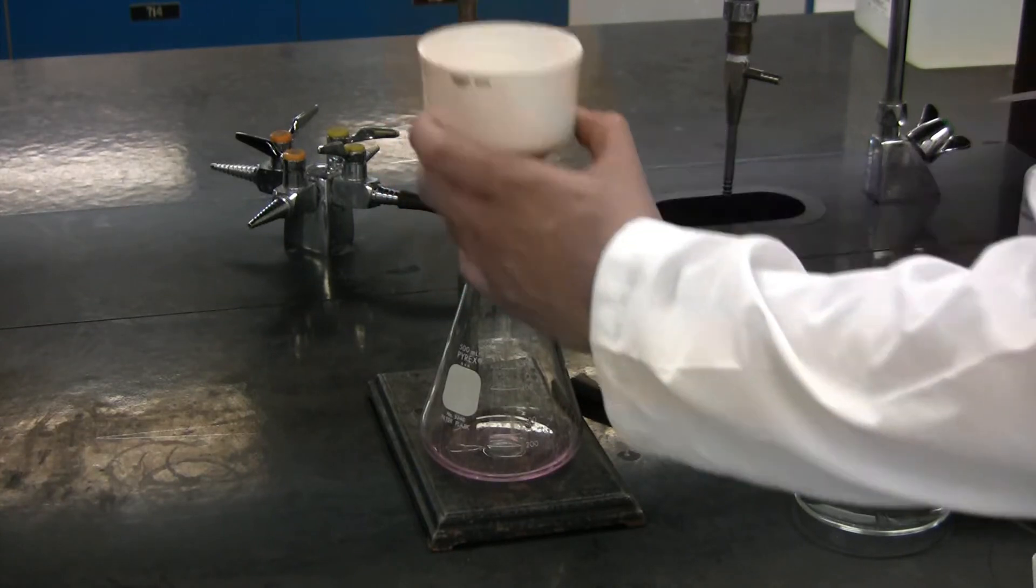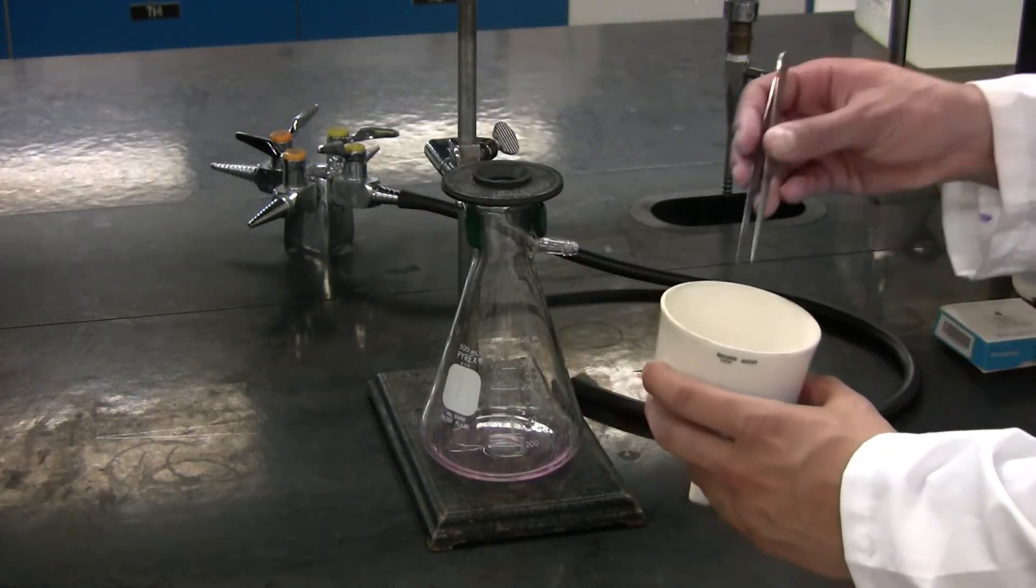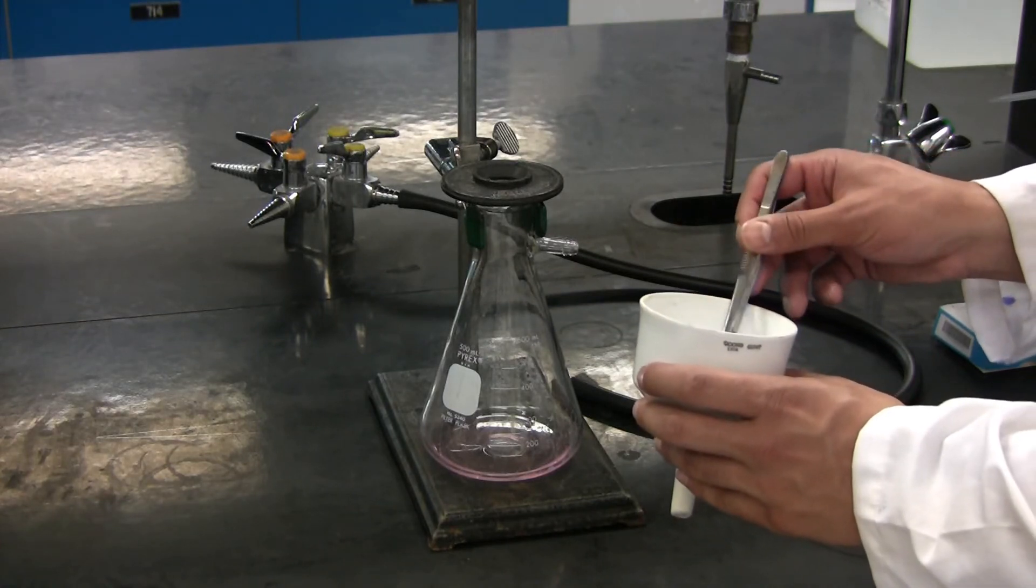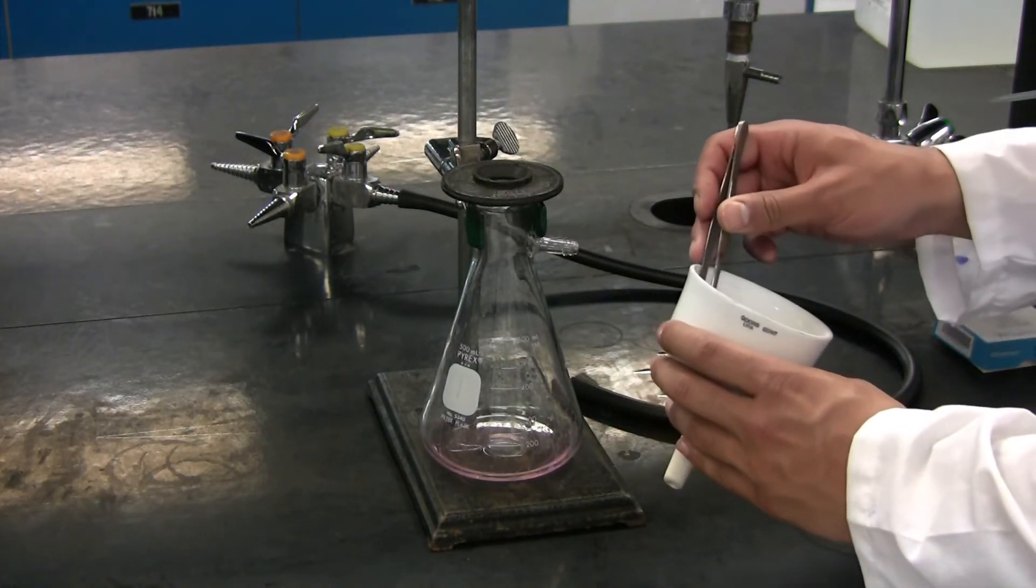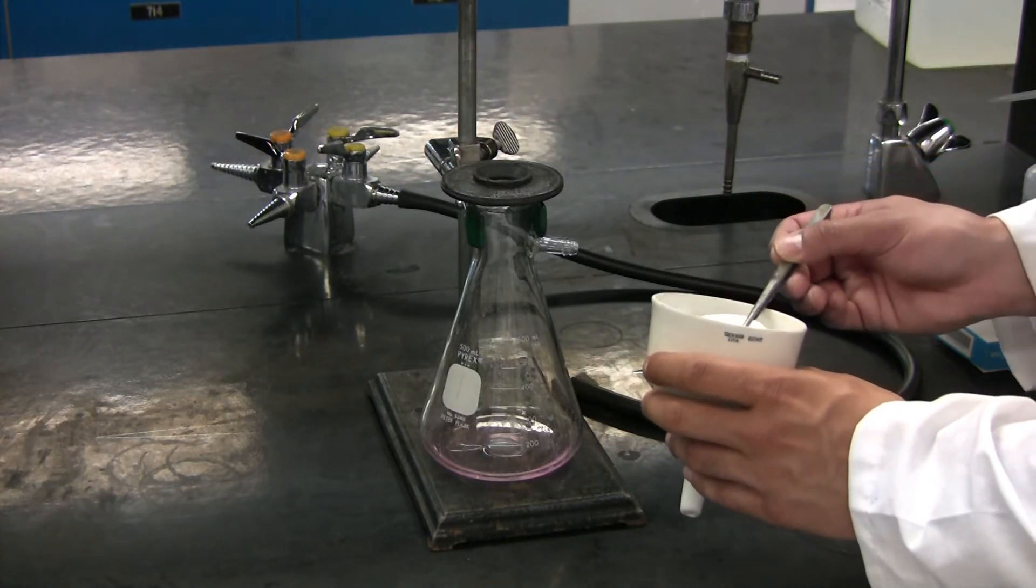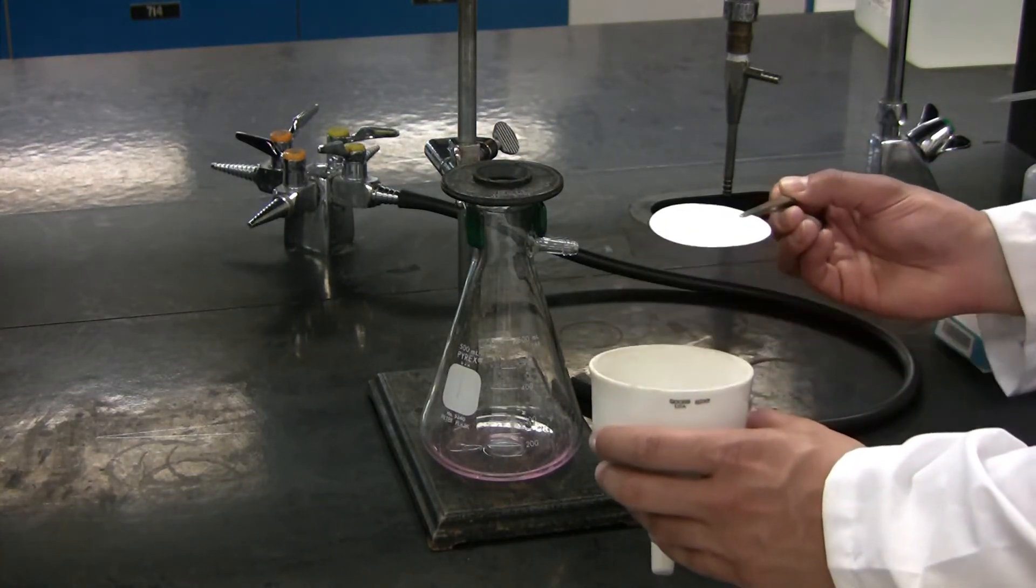You can remove the Buchner funnel, and using a pair of tweezers, gently remove the filter paper. Once removed, place this onto a watch glass.